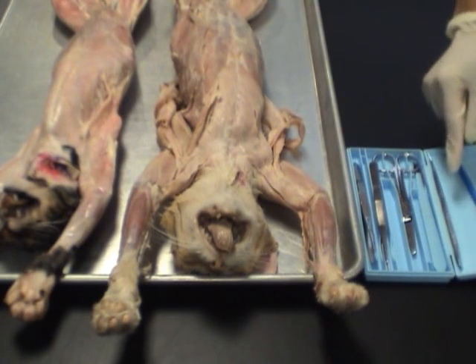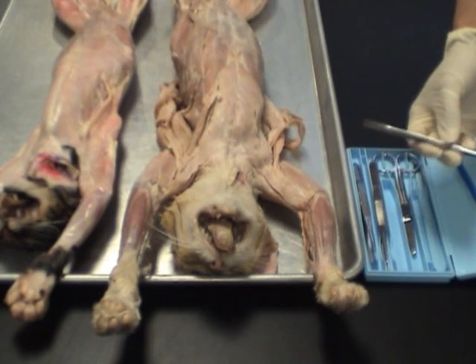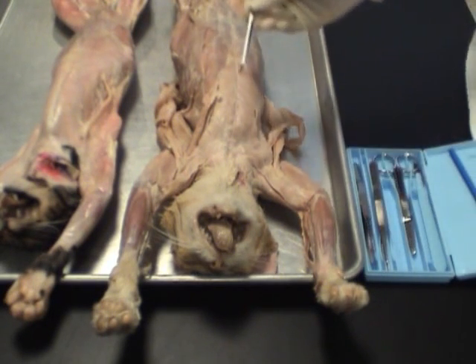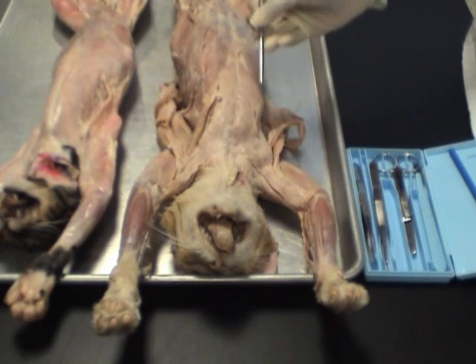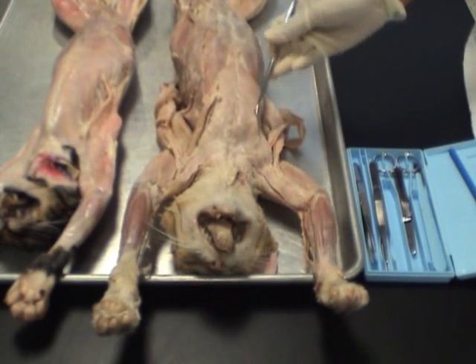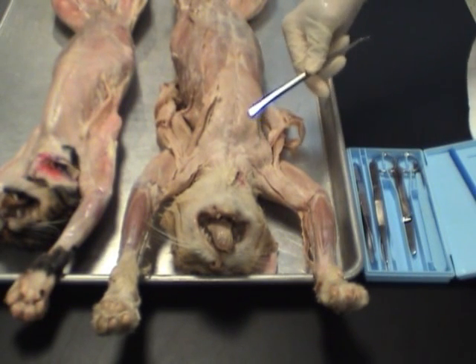In this box we have two kinds of probe. We have a probe that has a blunt end and a beveled end. Probe can be used as a pointer. For example, you're going to point to a muscle instead of using your fingers. This is more professional. You can use it to lift up muscles. And of course you use the other end for the same purpose, for lifting and pointing.